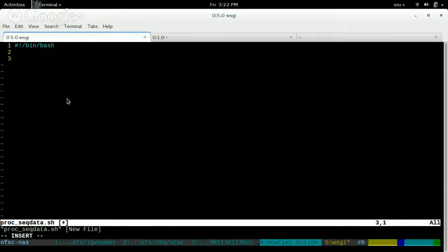And then I can do lots of stuff here. I can say echo hello. I can copy a file from hey to hey2. I can also go into my data folder, and then for each file in this directory, I want to, actually, I forget how to write it. I think this is how. And then I want to process this file.